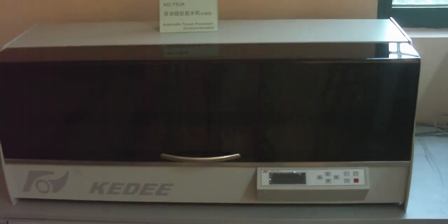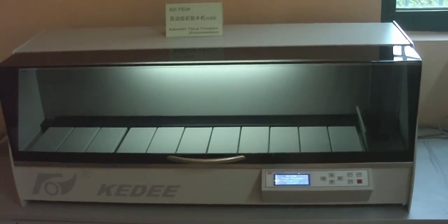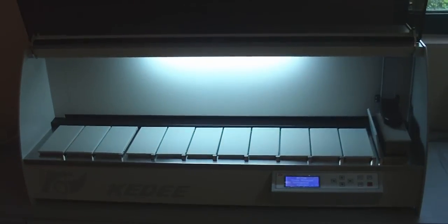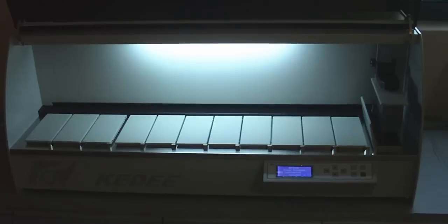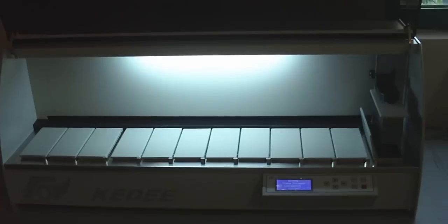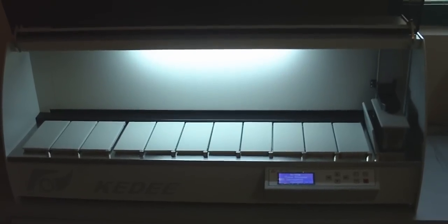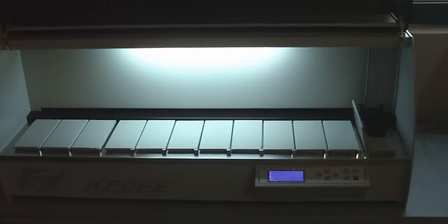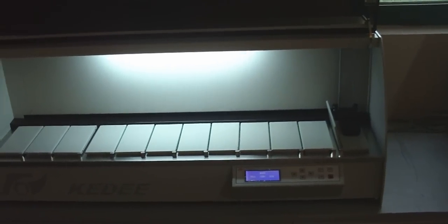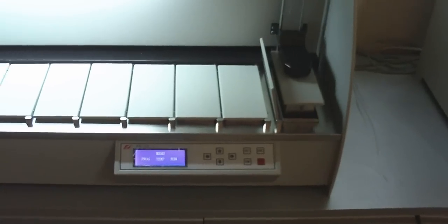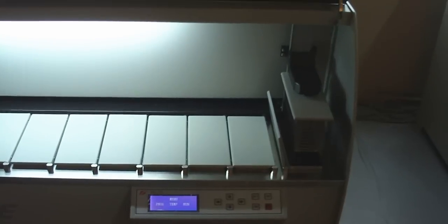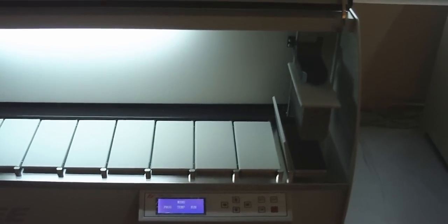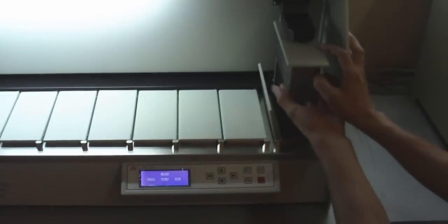Switch on the power, press the up key, and install the basket to the arm.